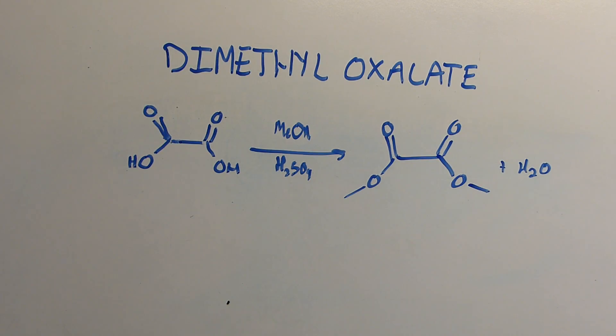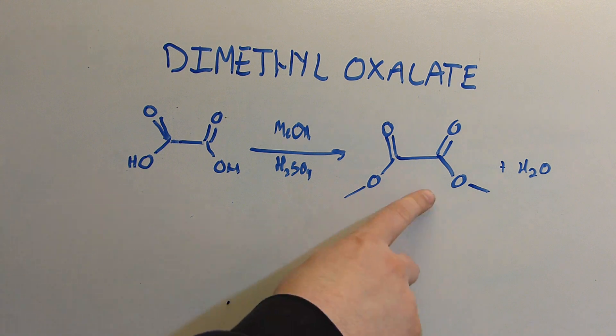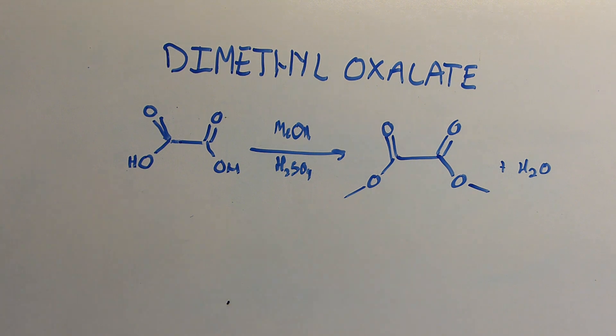Hi everyone, and welcome back to the lab. In this video, I'll be making dimethyl oxalate using oxalic acid and methanol.